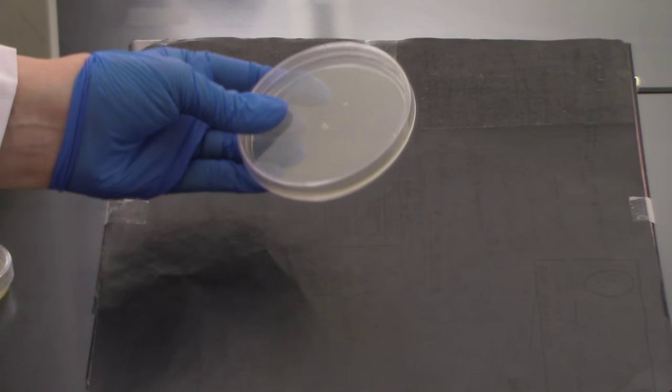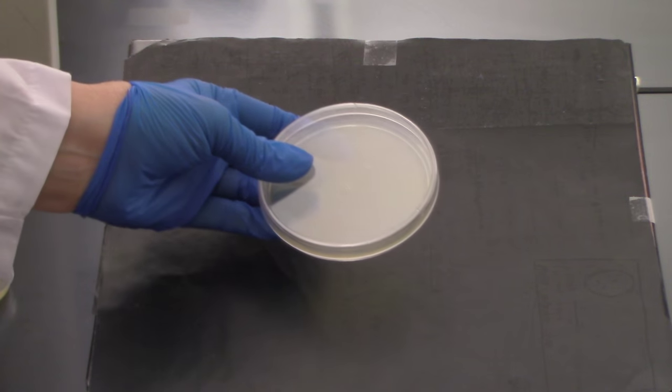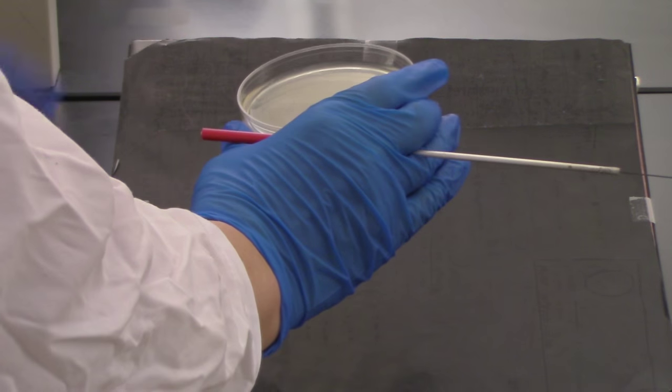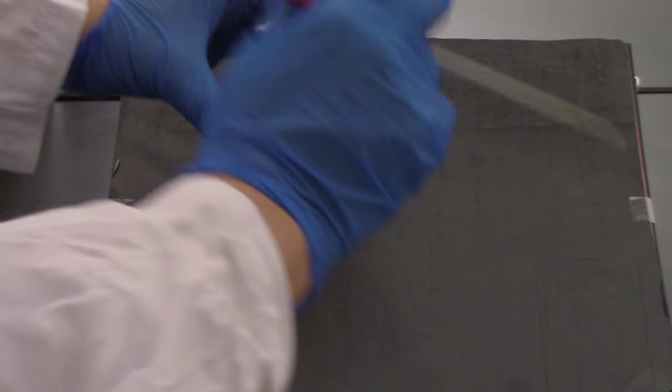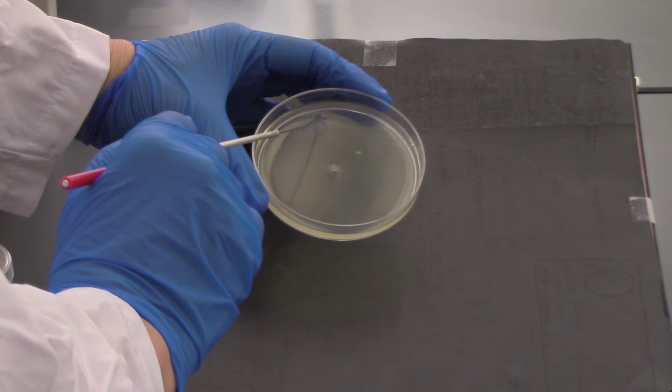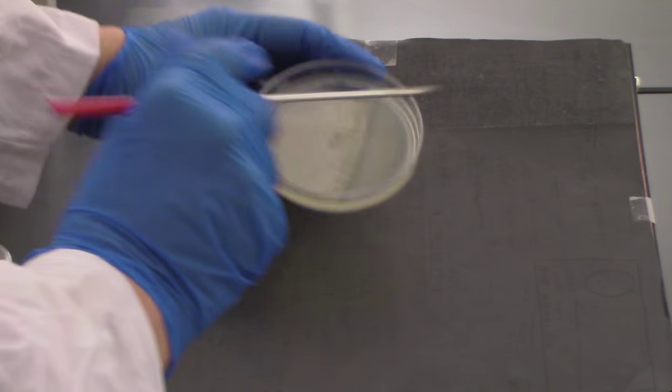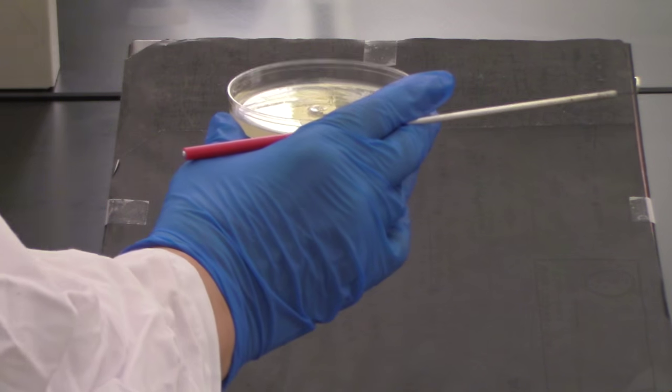Sterilize my loop, let it cool. Go back — this is going to be my next set of zigzags. I'm going to go back through several times. The idea is that I'm thinning this out. Then put my lid on.